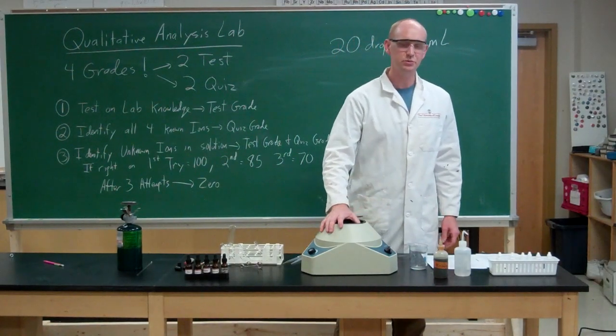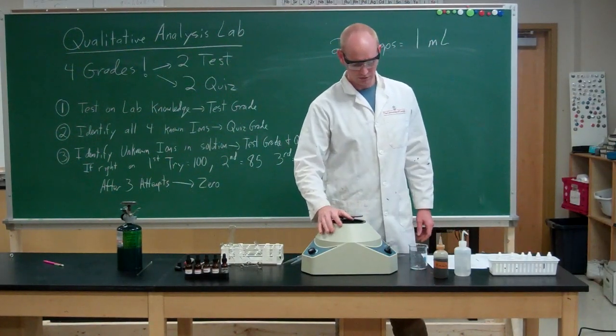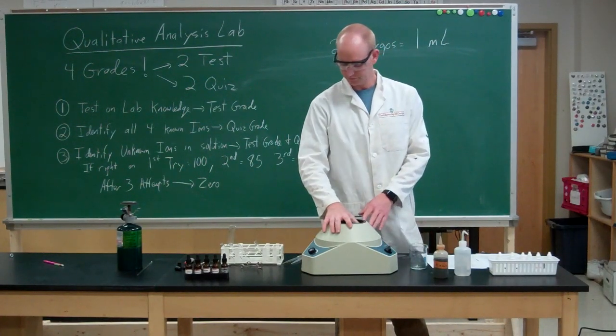And again, you want to let that spin for about 2 minutes. I'm doing mine a little quick.